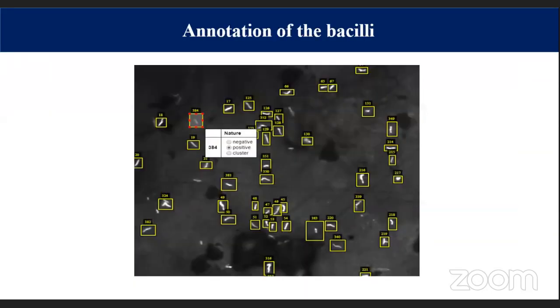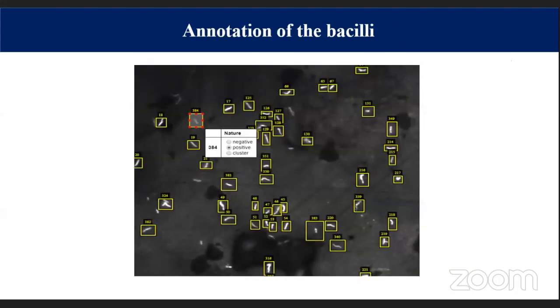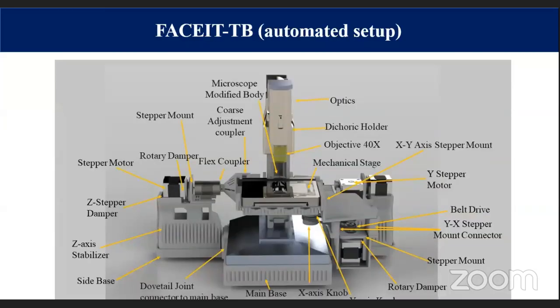So what it does is not just observe or scan the whole slide that has been put in. It also does the image processing and artificial intelligence based detection. But this does not all happen on the microscope side. There is an IoT module inserted here.